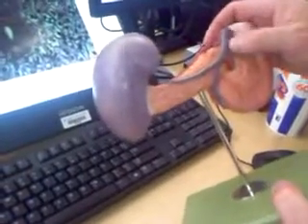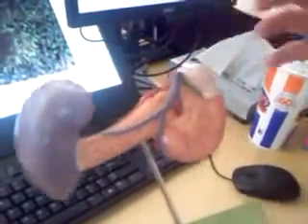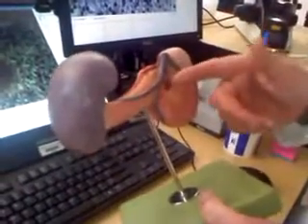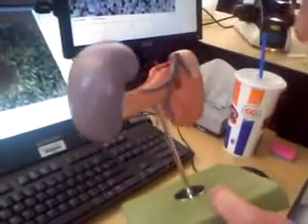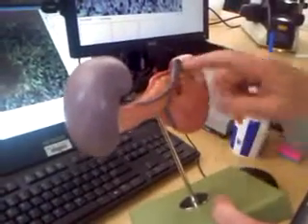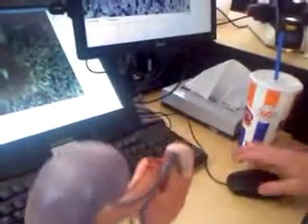So this hepatic portal vein is what we bring all of the things that have been absorbed from the digestive tract down here, you know, since it's the mesenteric arteries and veins, we're looking at the small intestine and large intestine's absorbed material. So if we bring that back into this hepatic portal system and into these sinusoid pathways here, the sinusoids contain Kupffer cells and run along through the hepatocytes adjacent to them.